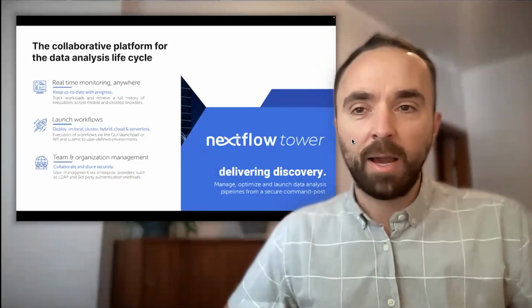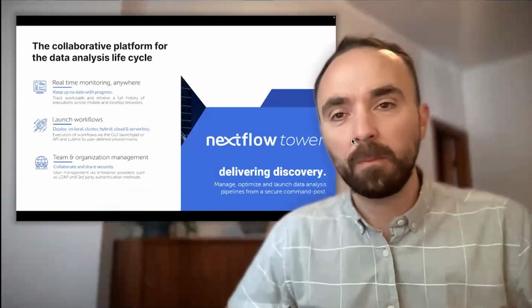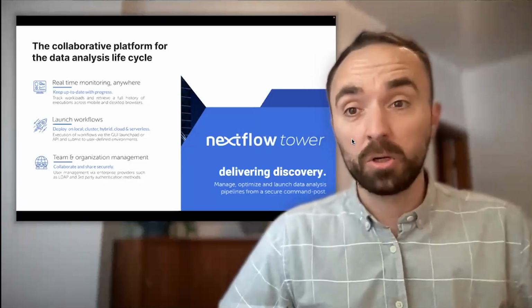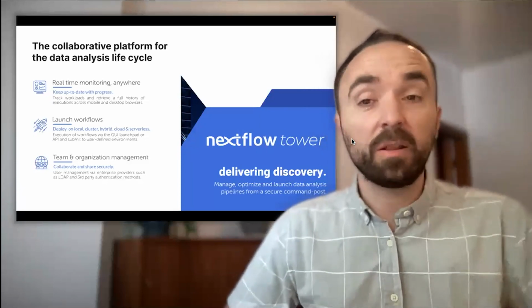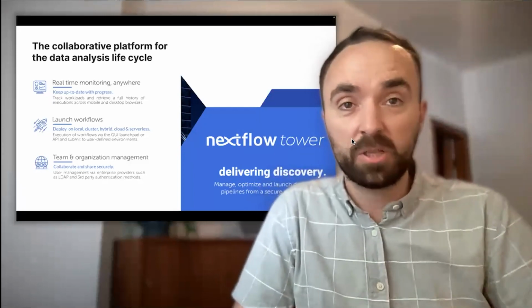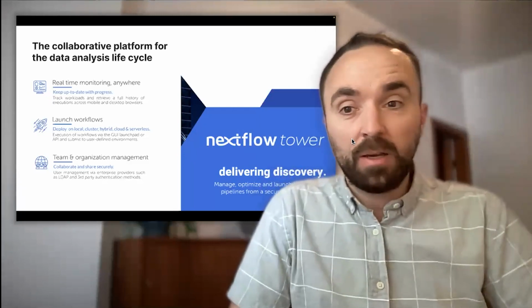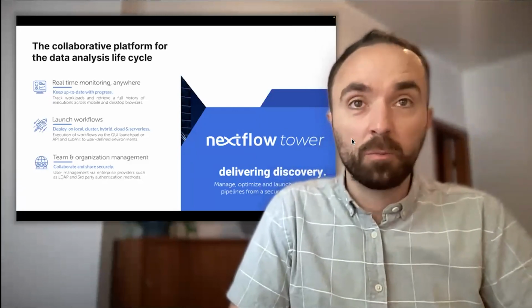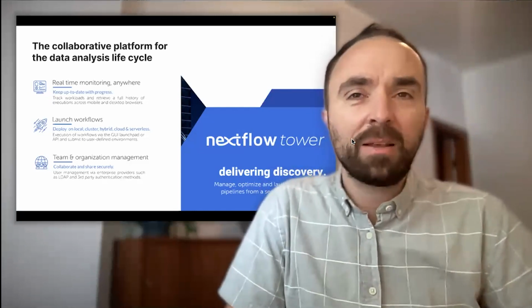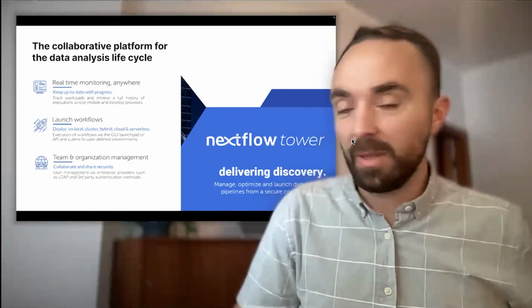So we have Seqera, the company, NF Core, the open source community, and on top of that, we have Tower. And Tower is a layer on top of Nextflow that adds some extra features that we thought were missing. Nextflow Tower is our commercial offering from Seqera. It provides real-time monitoring, also a very quick and easy web interface for checking the status of any in-progress runs, and enables you to launch workflows, be it on any of the supported cloud computing platforms or on HPC-style platforms. It also allows you to do important work with collaboration, team, and organizational management.